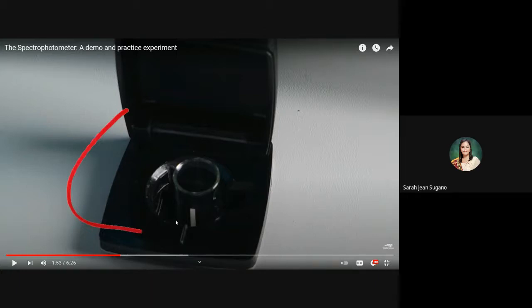Okay, and also you use Kim wipes, a specialized tissue, because it will not leave traces, unlike other ordinary tissue that leaves debris of tissue. Kim wipes are really specialized only for spectrophotometry, and they are also expensive. Kim wipes are really expensive. This is the only tissue I have encountered that is really expensive. So it should not be used on your face. Okay, so let's continue.